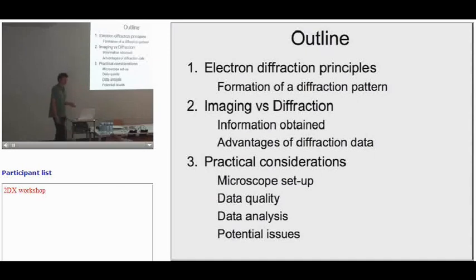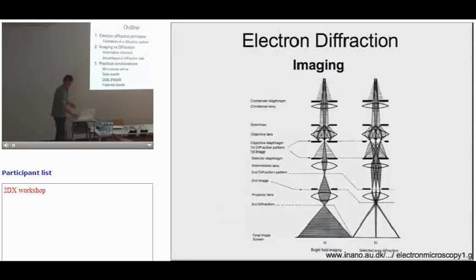Actually, when I was a student in this course 4 years ago, Janet gave the lecture on diffraction data collection, so I modeled it somewhat after hers with a short description of how you actually form a diffraction pattern, a comparison between imaging and diffraction, and then actually how you collect diffraction patterns.